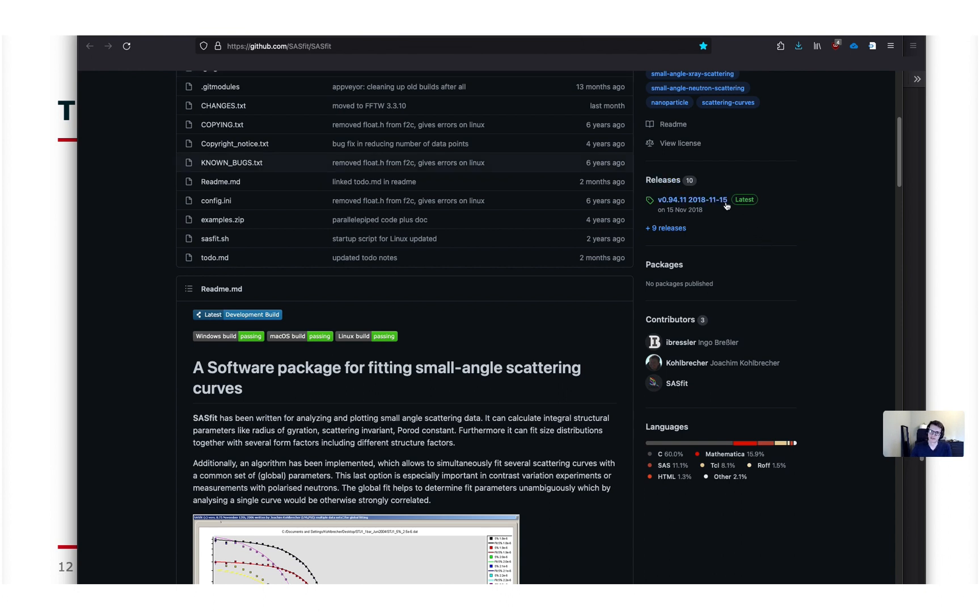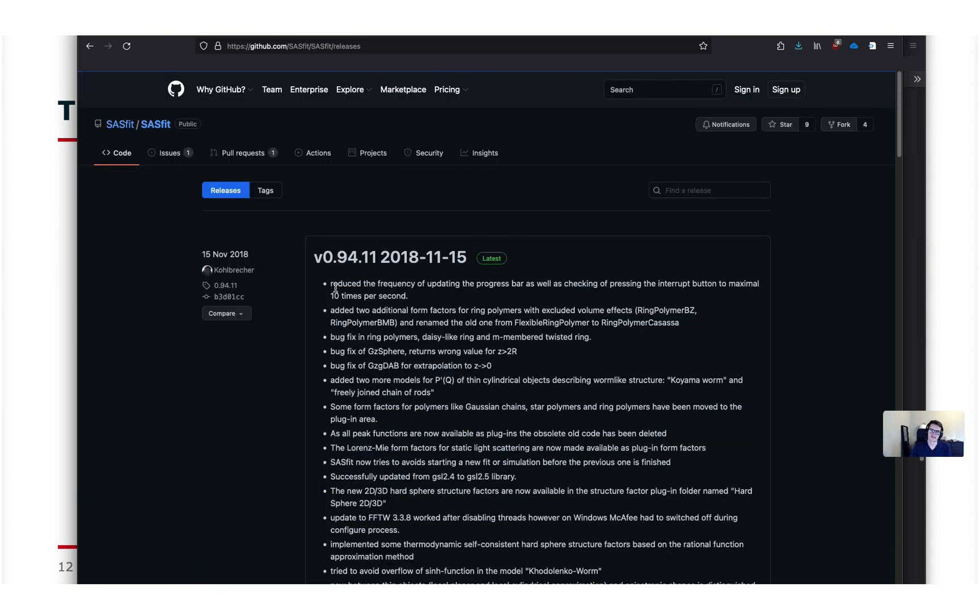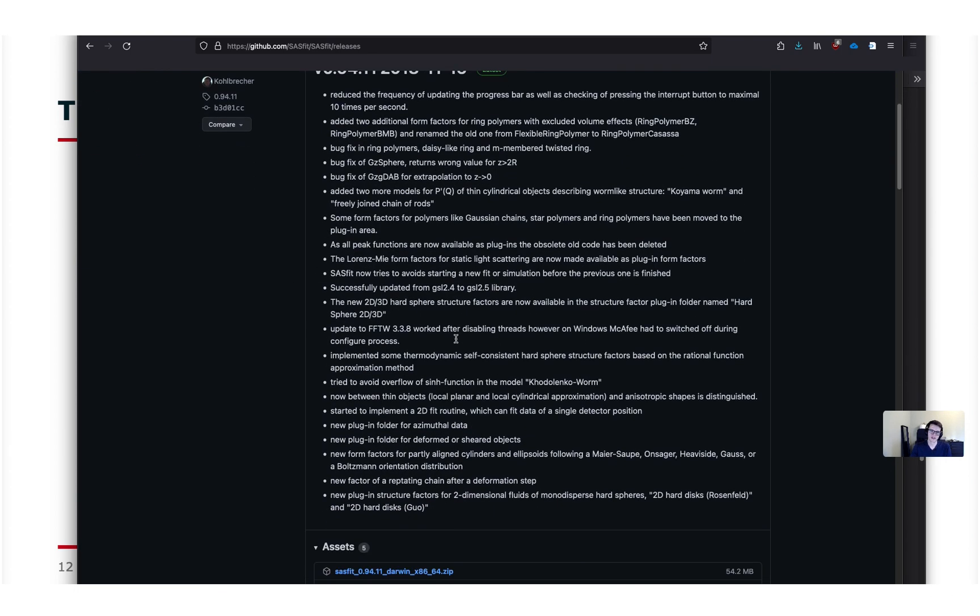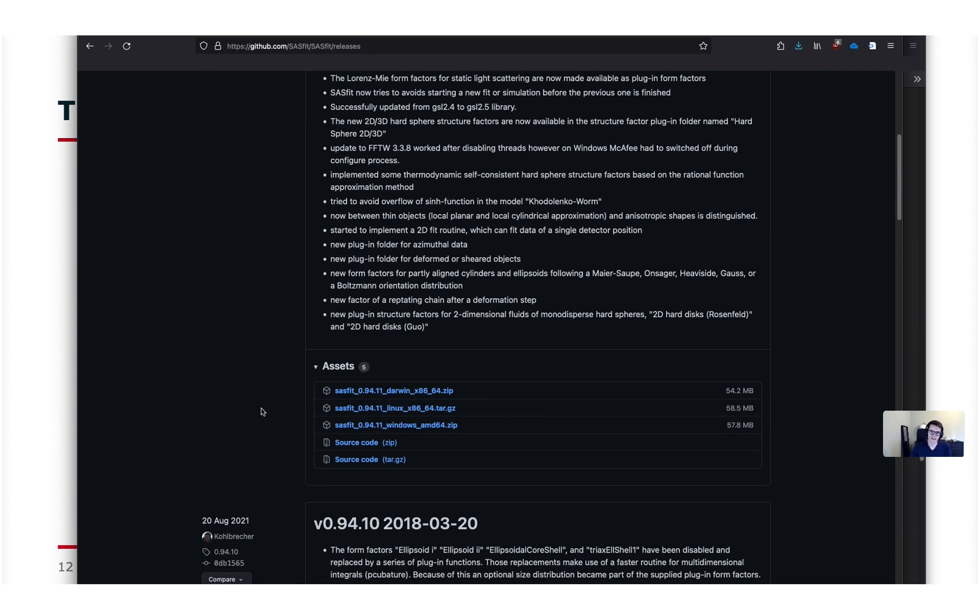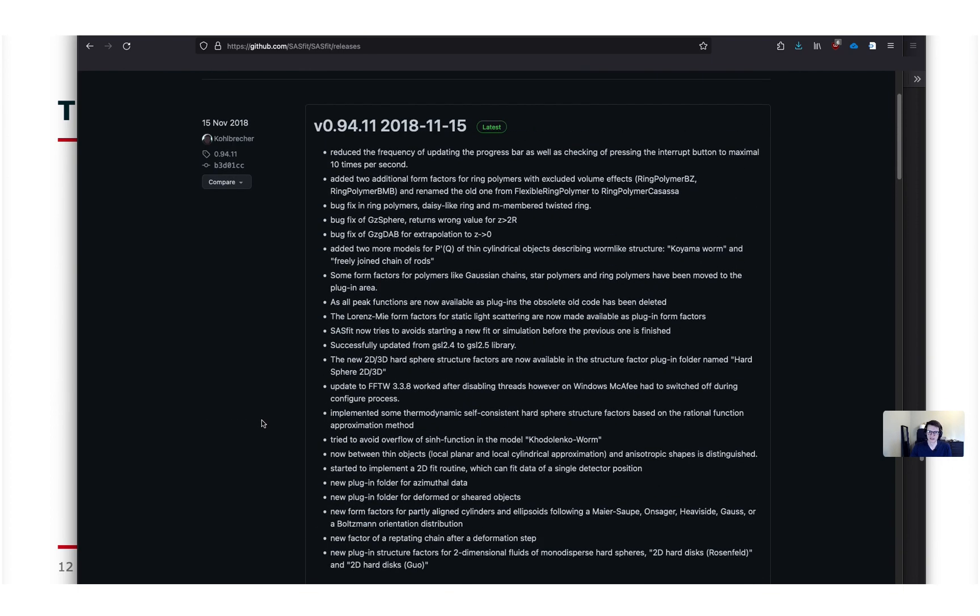If you click on release you get to the release pages. There's also often a quick overview of the changes in the program since the last version in a quick overview along with the links to the program version for the different platforms. The changes are basically very often motivated by the work of Joachim in his daily work for his users at his neutron scattering beamline and sometimes reflects what he is working on with his users.